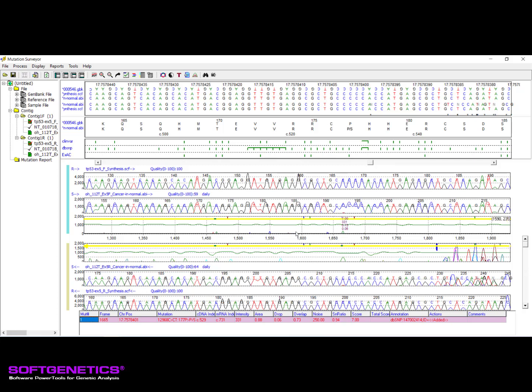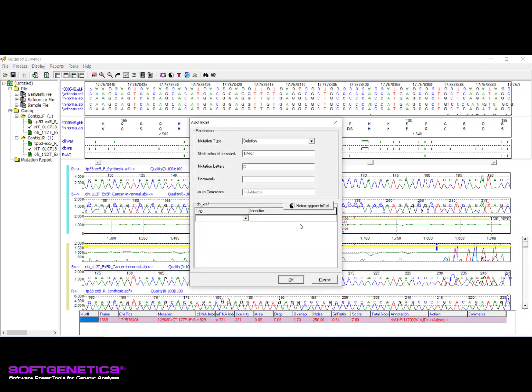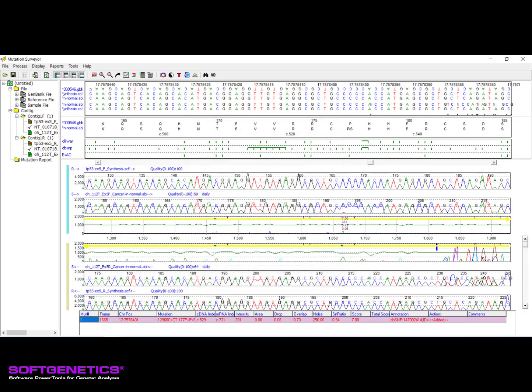To add a homozygous indel, hold the Control keyboard button and then use the left mouse button to click on the mobility line that runs along the middle of the mutation trace at the location at which you would like to add the indel event. Using the dialog that opens, add your desired call and any custom annotation and click OK. This will result in the addition of the indel event.